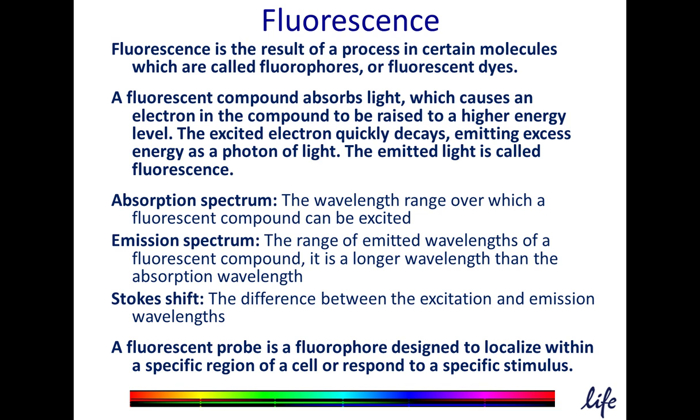A fluorescent compound absorbs light, which causes an electron in the compound to be raised to a higher energy level. The excited electron quickly decays, emitting excess energy as a photon of light. The emitted light is called fluorescence.